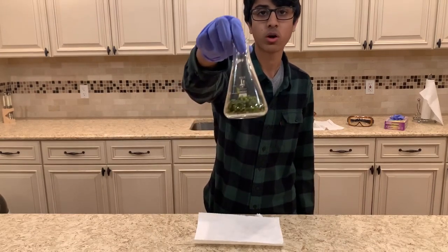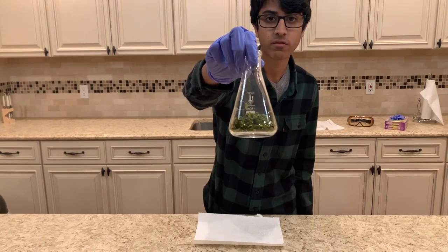Now that it's all dry, we have 12.305 grams of the ground-up peppers.